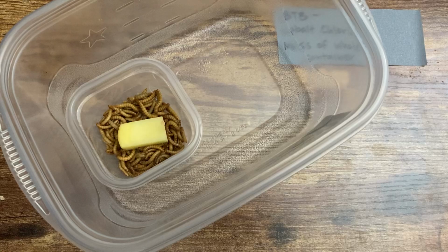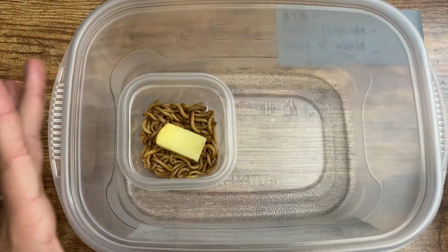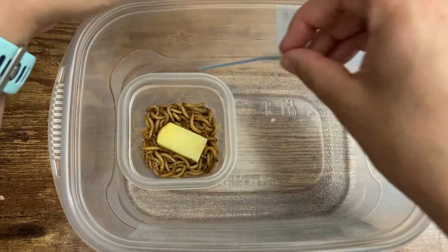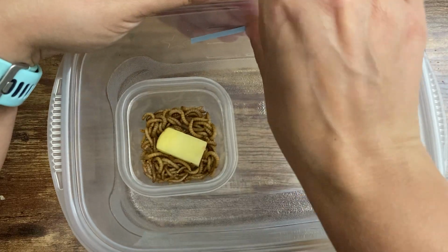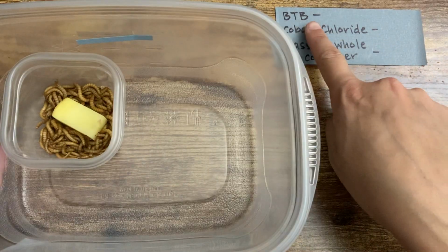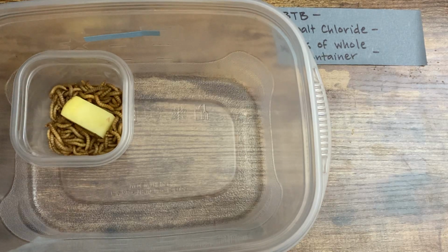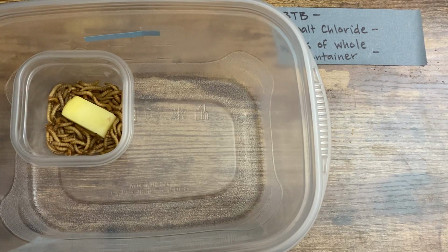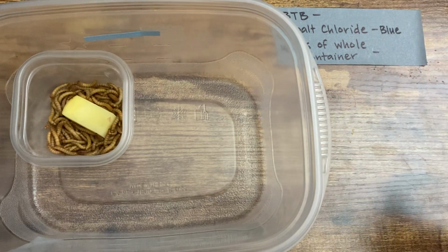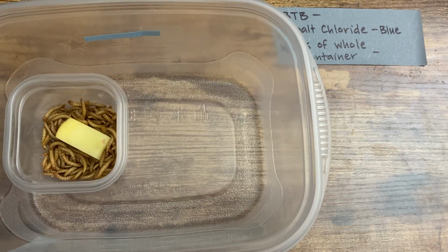So I've got some indicators here. We're gonna have BTB, cobalt chloride, and then I'm gonna find the mass of this whole container. So here is my cobalt chloride strip, and I've got some tape on it because I'm just gonna tape it to the side of this container. So you can see that it's taped there, and I'm gonna record that the starting color of my cobalt chloride strip is blue. And cobalt chloride will tell us if there's any water that's released from this situation.